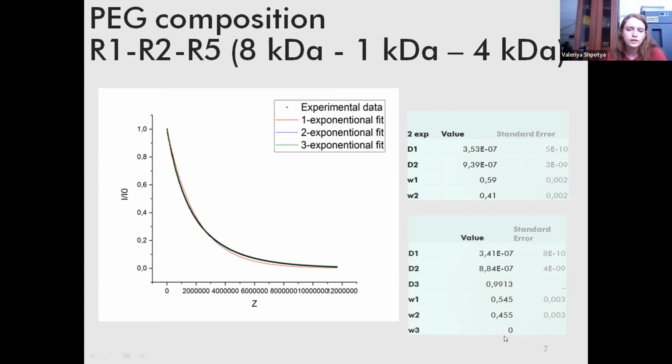Of course, when the approximation by 3 exponents shows one parameter is 0 or close to 0, it may be not meaningless, but, how to say, it's the result of approximation, and I think I should show it to make the sense that in our case maybe there is no difference for 128 points between 2 exponential fit and 3 exponential fit.